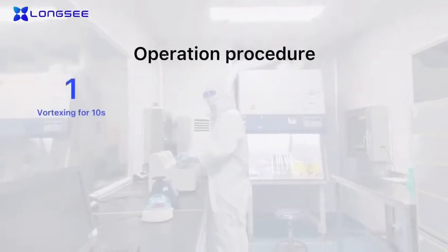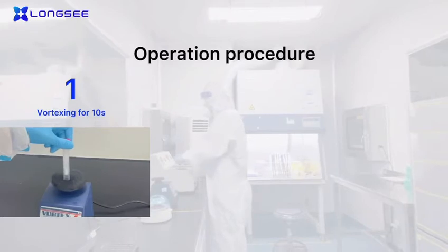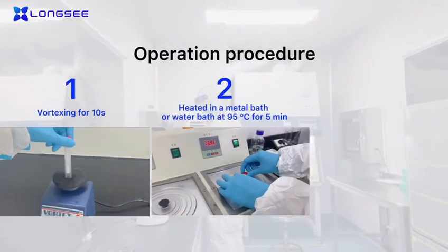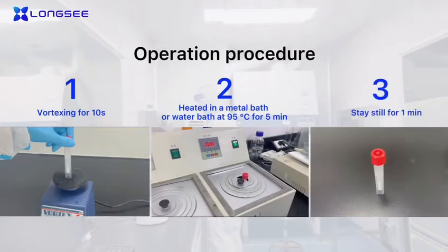Vortex for 10 seconds. Heat in a metal bath or water bath at 95°C for five minutes, then stay still for one minute.